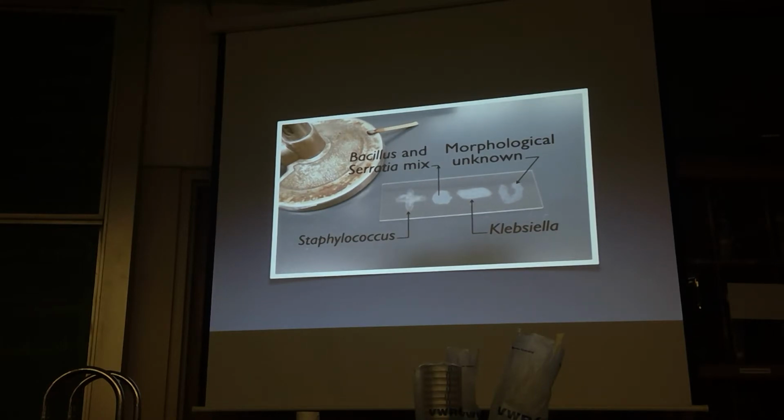We have 2 gram-positive cultures. They are Staphylococcus aureus and Bacillus cereus. They are in the trays. Each table has 4 tubes, 2 of Staphylococcus, 2 of Bacillus. These are 24-hour-old cultures, so they should be in good shape. The problem with gram-positive cultures is they will lose their stain quality over time, so we want them to be young. We're going to put Staph in the plus sign. We're going to put Bacillus in the mixed smear.